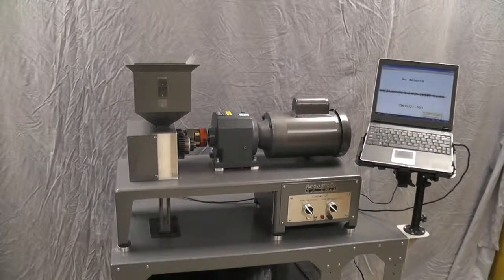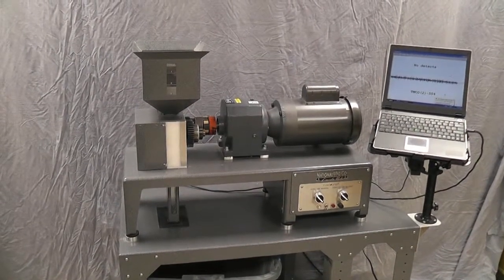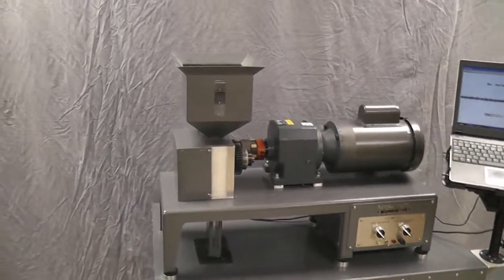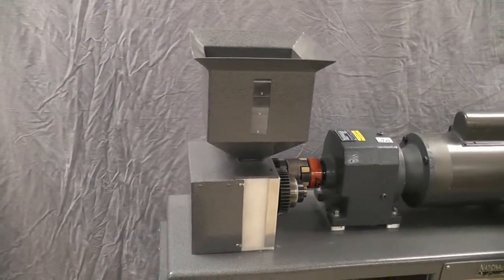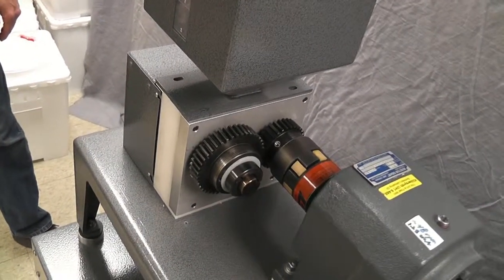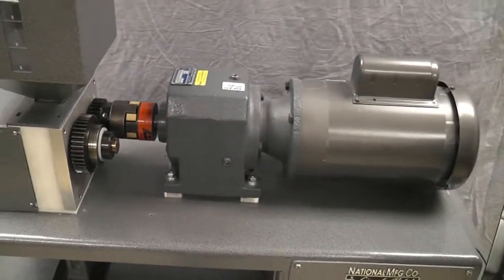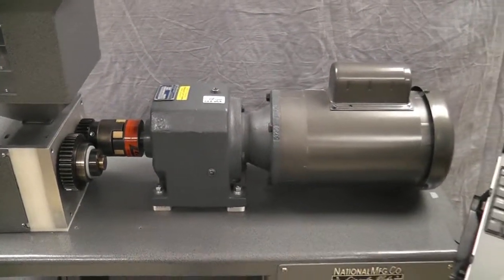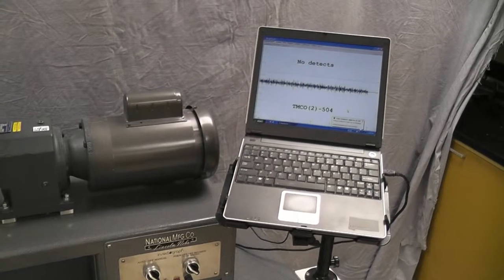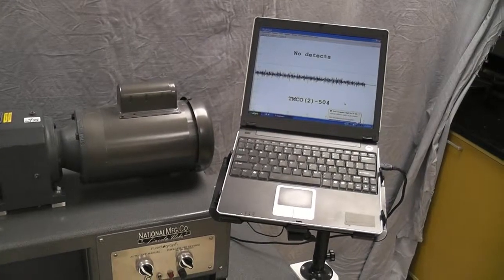Here is the conductance mill developed at the USDA ARS Center for Grain and Animal Health Research in Manhattan, Kansas. There's a hopper right here that we feed wheat into. There's a couple rollers inside that aluminum block there, powered by those gears. The gears are powered by the gearbox and motor. The computer there collects conductance data as kernels are being crushed and analyzes it to see if there's an insect inside some of the kernels.